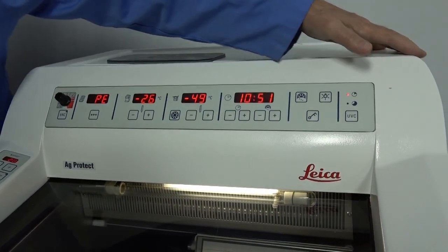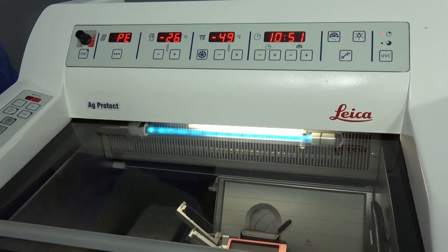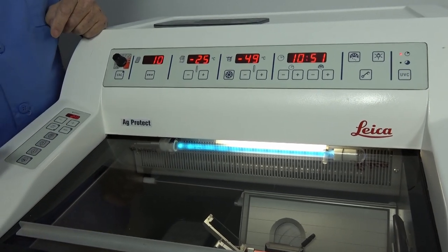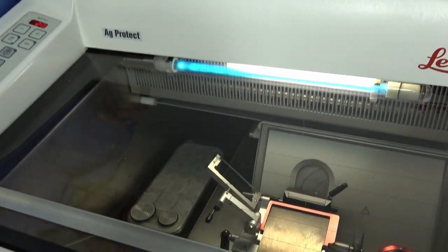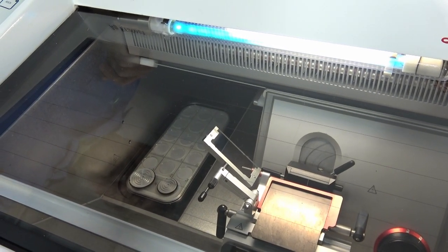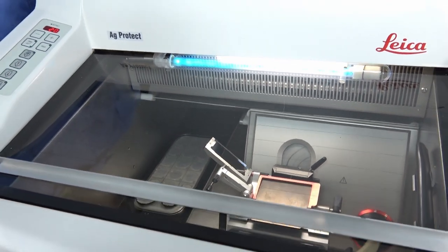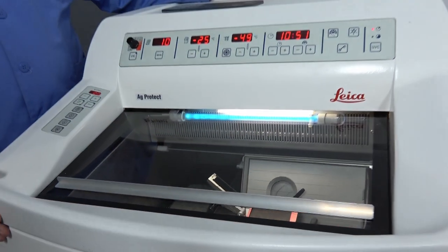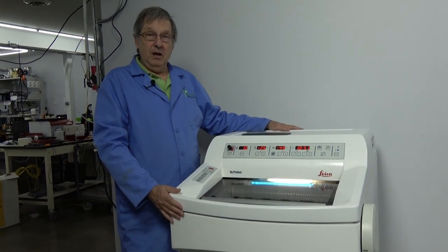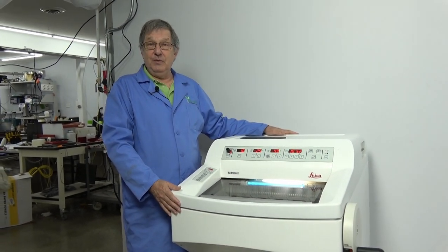The UV system on this particular unit works, and you do have the option to turn on the Peltier cryobar to freeze your samples that are on the cryobar there. That's the Leica CM1950 that we're going to be offering. Give us a call if you have questions on this or any of our products. Thank you very much.